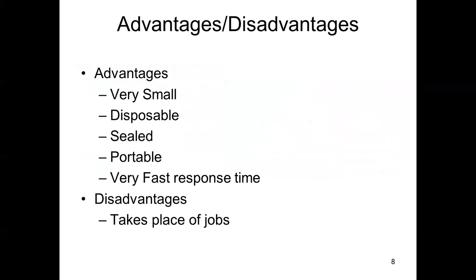A disadvantage is probably that it takes the place of a lot of people's jobs. So it takes the intermediate expertise out of this, because basically the device itself is moderately smart. So we don't need to have rather intelligent technicians to run this process. It runs automatically through the design of the device, and then all we need to have is an expert do the analysis for that application.